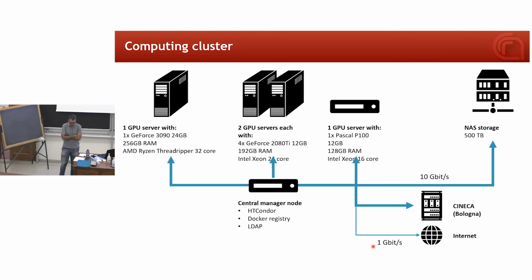Yeah, understand what you mean. Speaking of JPEG 2000, I'm not super happy with the solution. We're looking into alternatives. Yeah, it's true that it's made for the human eye. But then the network sort of has to see these features. One problem is if you train the network on uncompressed data and then you do prediction on compressed data, that's a problem. We've seen that if we use both compressed and uncompressed data and we train the network with the same kind of data set, it sort of works.